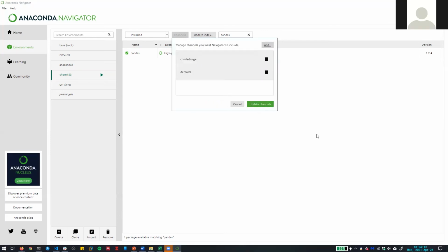I typed it in, but it's coming up with a little stop sign with an exclamation point. Let me try it again. Yeah, I've never actually added channels through this GUI, so I'm not sure how it works. And you're on Mac, I'm assuming?